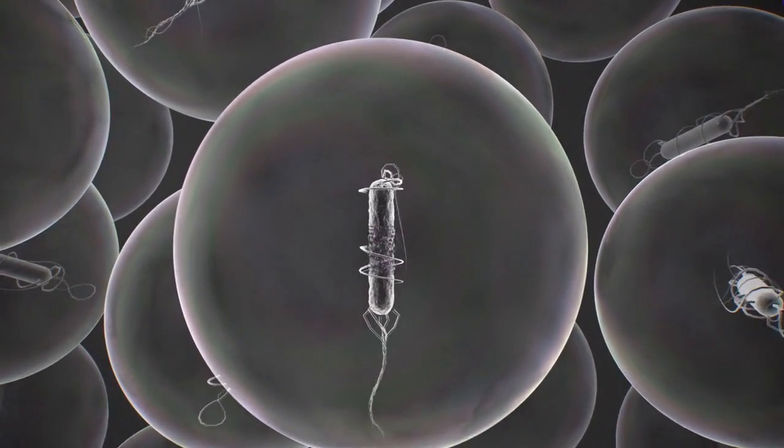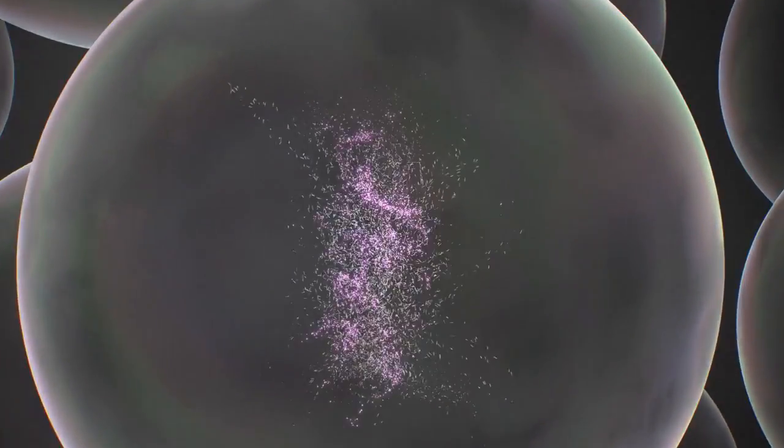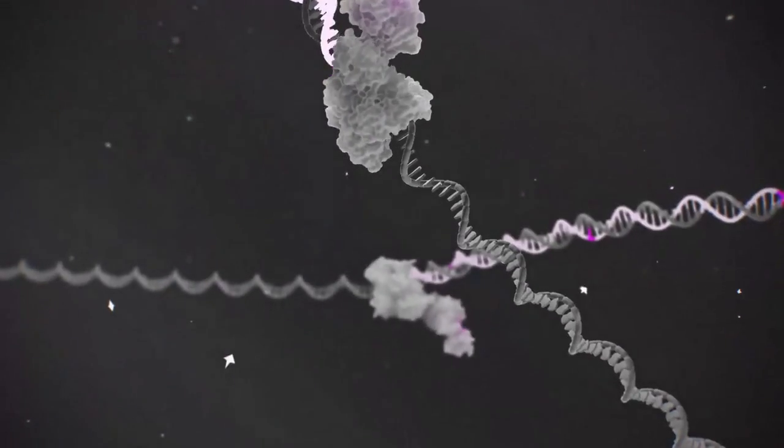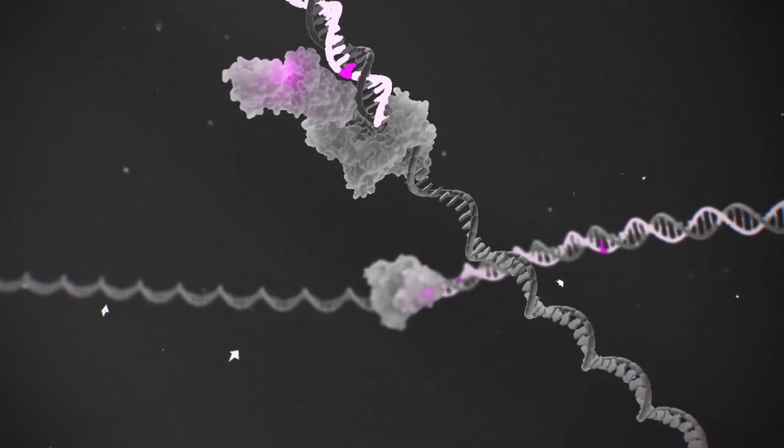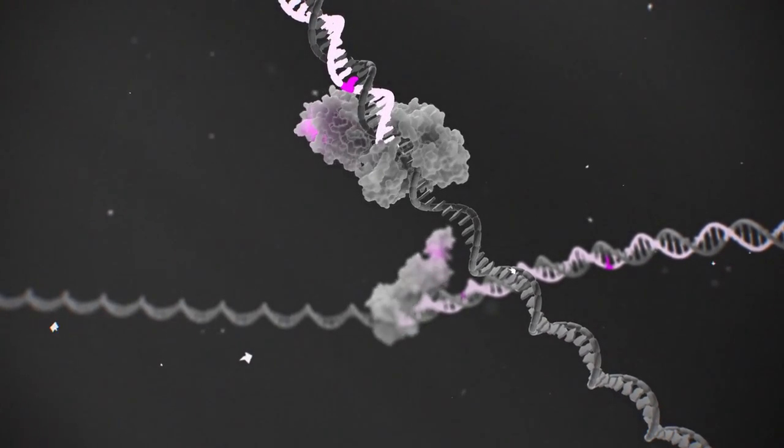We burst the E. coli cells with heat, releasing the thermostable TAC variants into the droplets. Each droplet becomes a micro-reactor where the most fit polymerase variants copy more of their own DNA. Millions of these reactions occur simultaneously.